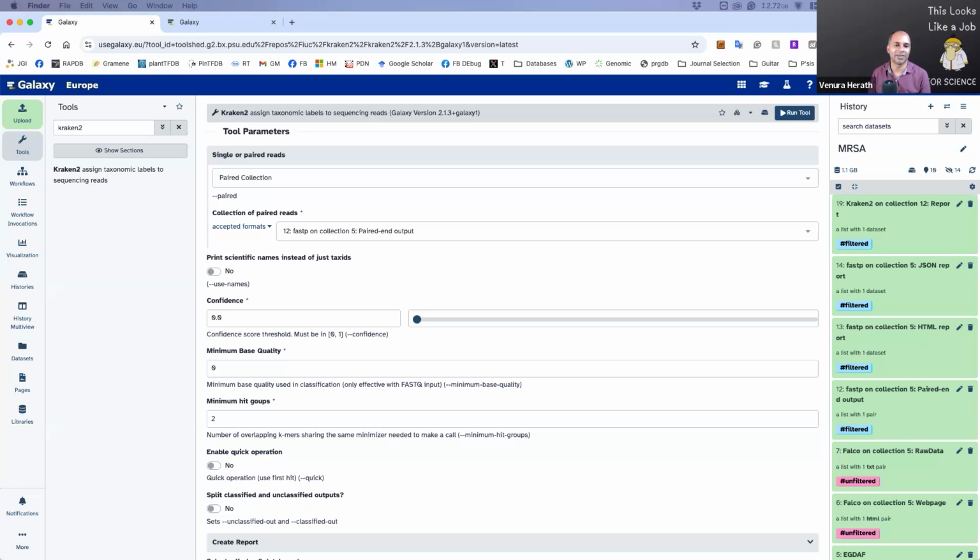So it varies. Yes, of course, we can look for multiple species at once. That's what people do when they do metagenomics. But if you're specifically focusing on a genome, then it is a different process you follow. Depending on the process, you can go towards more species or one species.